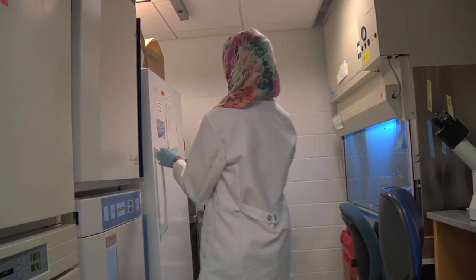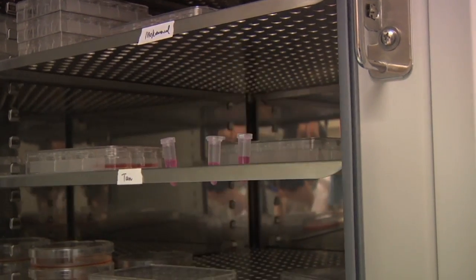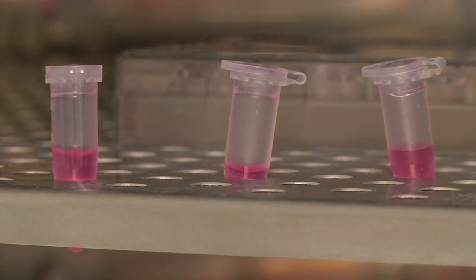After that, I start culturing these cells and put them in the incubator. Usually it takes about a week, and then after that I get a tremendous amount of stem cells. They start growing and proliferating.